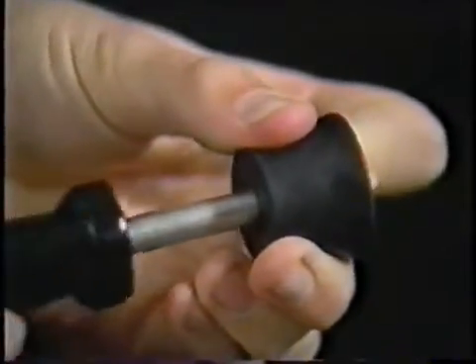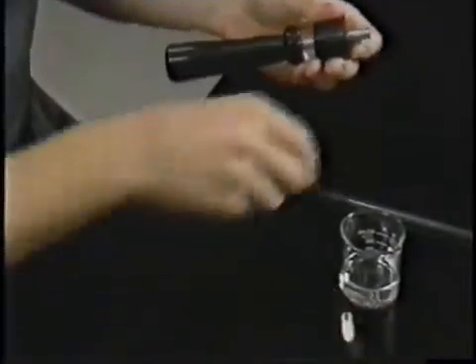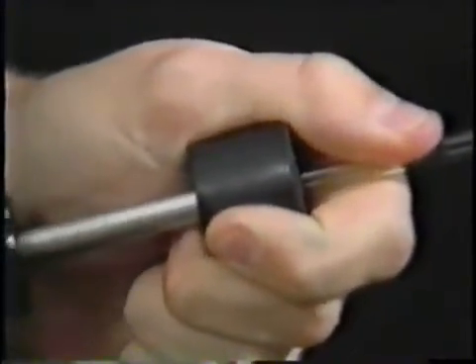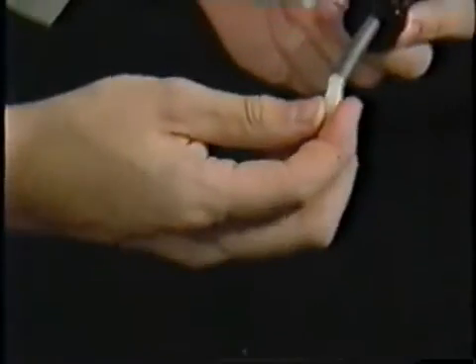Remove the tip and slide the tubing through the hollow inserter shaft. Removing the shaft leaves the tubing behind. Make sure to wash the lubricant off the tubing and stopper before using them, and replace the teflon tip so it doesn't get lost.